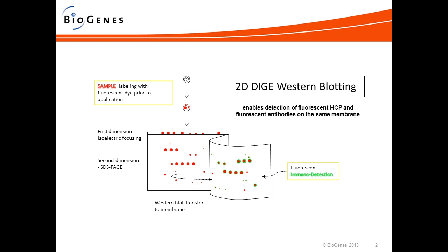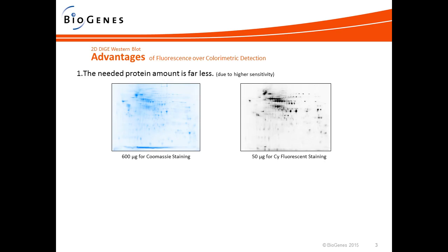Here at our company, we work with the equipment of GE Healthcare. We use the gel size of 20 × 26 centimeters. The large gel size improves the resolution.